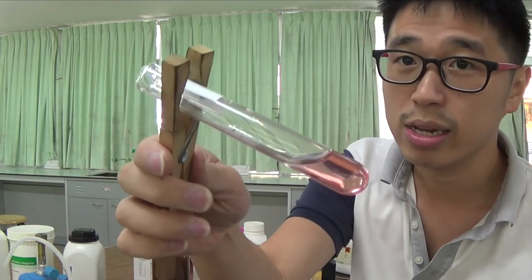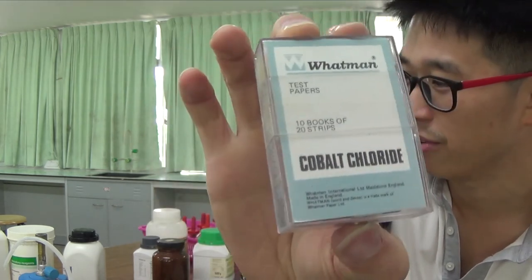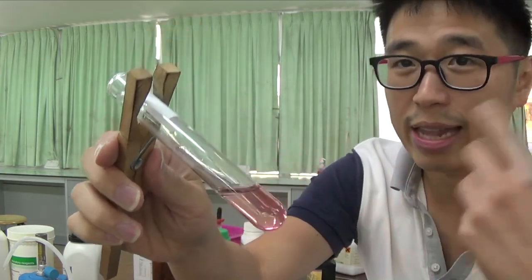Just like this, we use the blue anhydrous cobalt 2 chloride on a strip of filter paper. This is actually wrong. This is an expired cobalt 2 chloride. It's already totally pink. This should be the result if water is present. Just like when I added water to the blue solid just now, which was anhydrous cobalt 2 chloride, it turned back to pink.